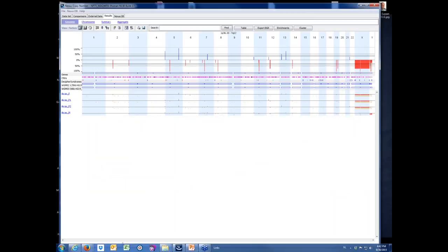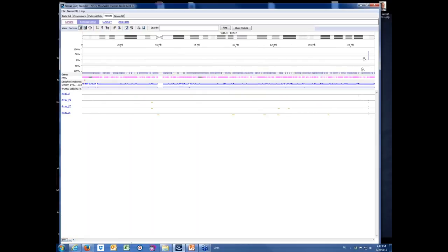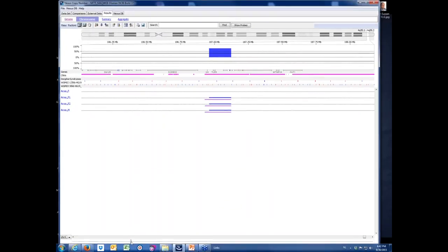You see this is the frequency plot. Here are the individual samples. This is the father, child 1, child 2, the mother. And we will focus on chromosome 4 and validate this region. So I move to chromosome 4, on the Q band of 35. And you see clearly that the duplication is inherited from the mother. And we had some interest to validate this region.